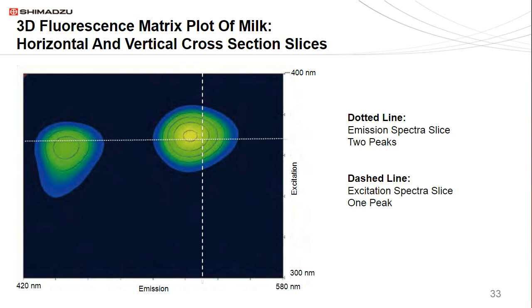like reading an X-ray. You have to kind of get used to it, because in general, the more symmetrical the peaks are, the more they're probably only consistent of a single component. Here we're looking at a spectrum of milk. There look to be at least 2 major components in it, because there's 2 mountain ranges, as well as the one on the left is probably not a pure component because it has a degree of asymmetry to it. But you don't really know. This is why a synchronous scan usually yields more definitive information.